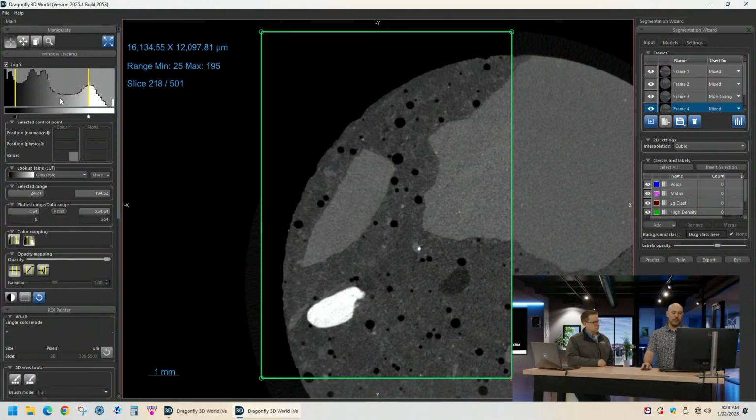The model is only as good as it's been trained. Yes, as good as the information it's been given. So like you just said, ambiguity. If you give it some ambiguous data, then it's going to return ambiguous data for you. So this is where you start simple. Start with frames that look easy.